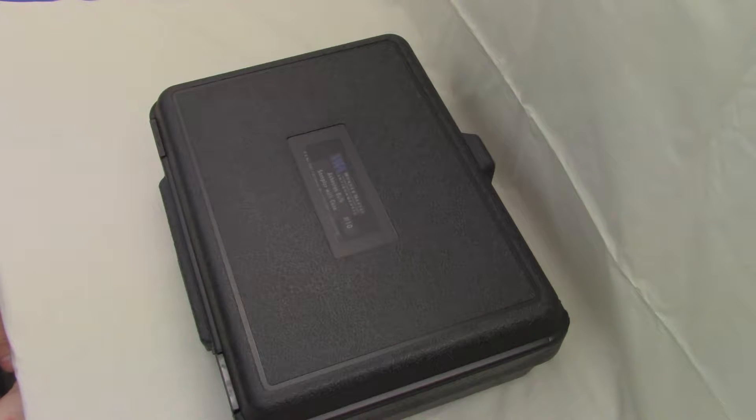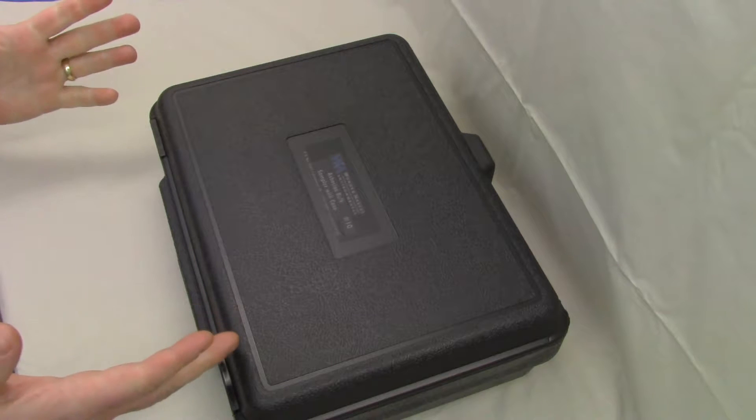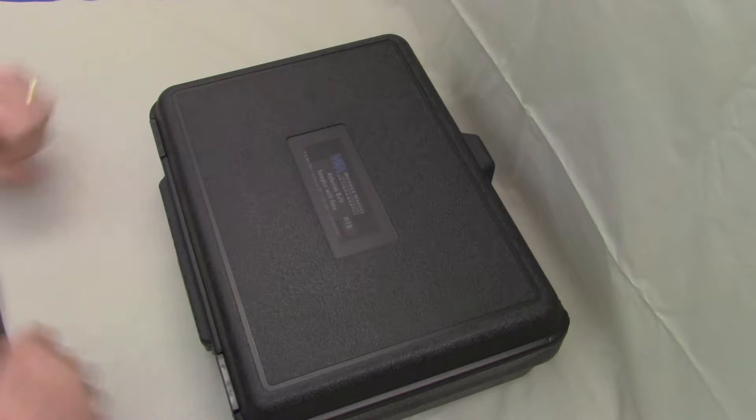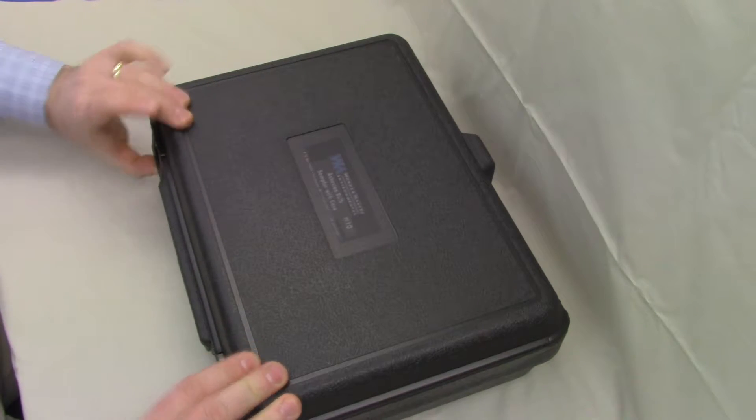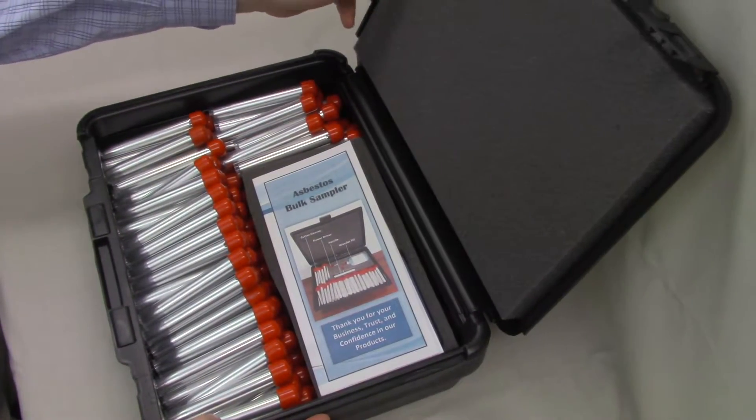Hello, my name is Jacob with Wondermakers Environmental, here to demonstrate the contents and use of the asbestos bulk sampler case containing the Wondermakers bulk sampling tool. Here's your case with your label on it. To open the case, we're going to detach these two plastic latches on the front, lift the lid up, and look at the contents.